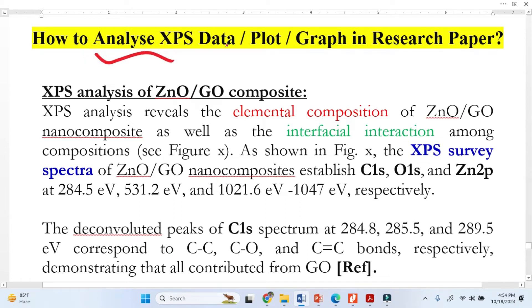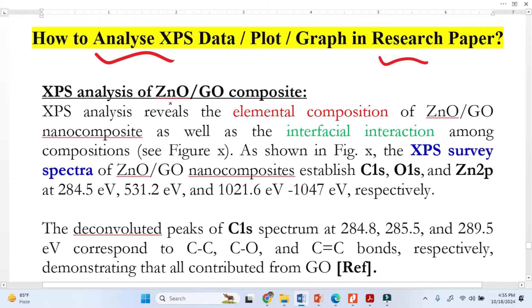How to analyze XPS data, or how to interpret XPS data in a research paper. If you want to write a research paper, include XPS data in your thesis or dissertation — how to analyze it and how to write the detail about the XPS analysis — this video is for you. In this example, we synthesized zinc oxide and graphene oxide composite.